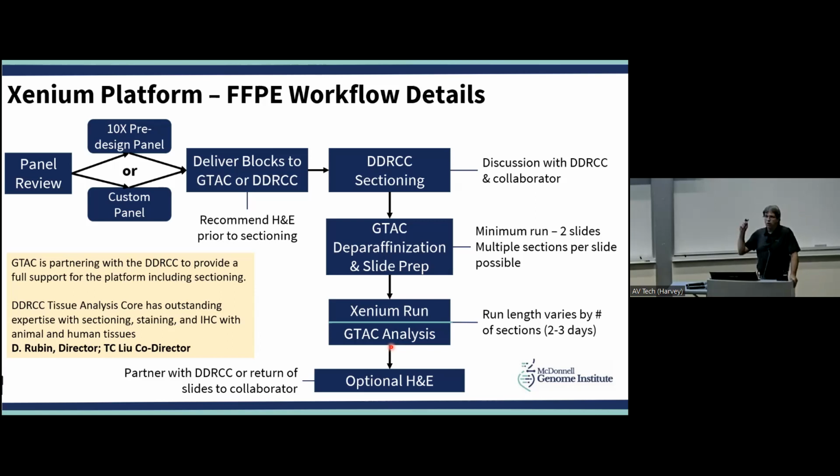Now, if you're not comfortable doing the sectioning and the placement of the sections, this is one of the reasons that we have a collaboration. GTAC at the MGI and the DDRCC are collaborating on this, because even we don't have that kind of expertise in our facility, but the DDRCC does. They do sectioning and placement of these sections. They are experts at this stuff. They have expert histology technicians that can do this in their sleep. And so we have partnered with them on this.